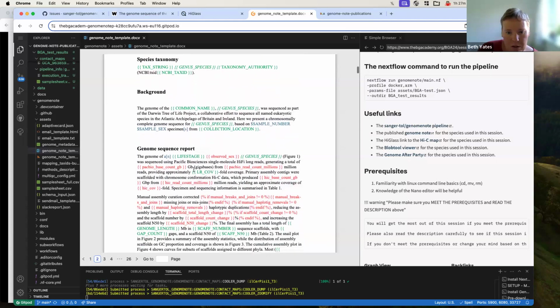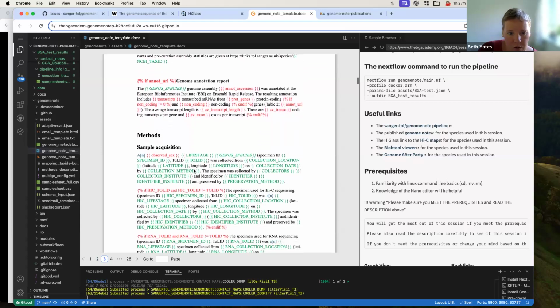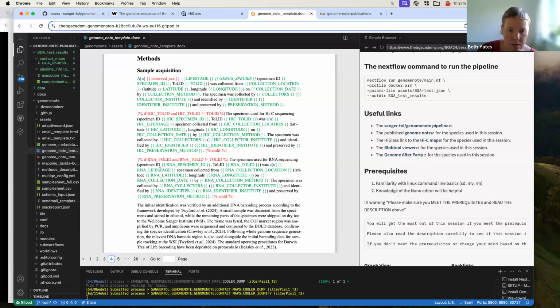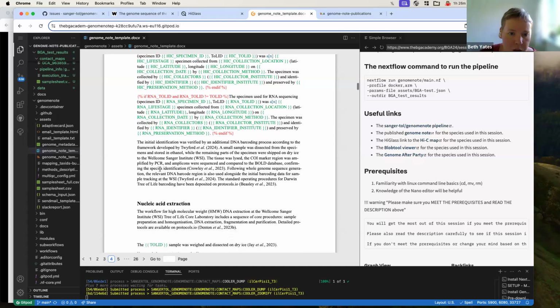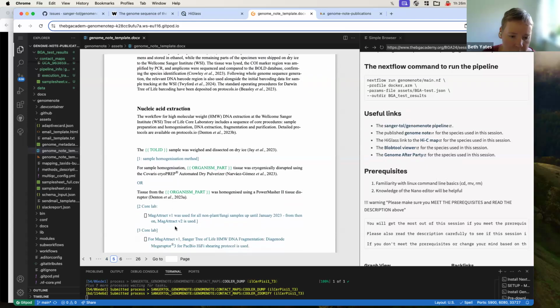Let's see what else there is. So we have optional sections. For example, if there is a Hi-C specimen that's different to the whole genome sequence specimen, we would include the section. Same with the RNA-seq. Merging the template parameters in will handle a lot of this for you. You can build quite a lot into the template to control what happens and what you get out.